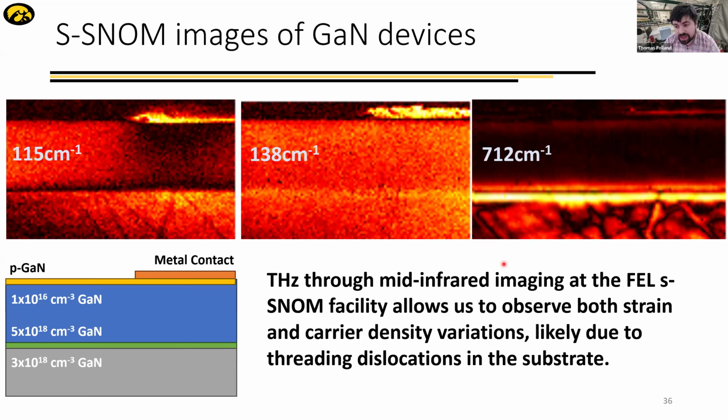We extract mainly from reflectivity, purely for simplicity in the setup when we started, but we now have the capability to do transmission as well. We haven't yet done cryogenic transmission, but in principle we should be able to, and we're setting up to do it now. But the SNOM measurements are done at room temperature only. I've only ever done them at room temperature.